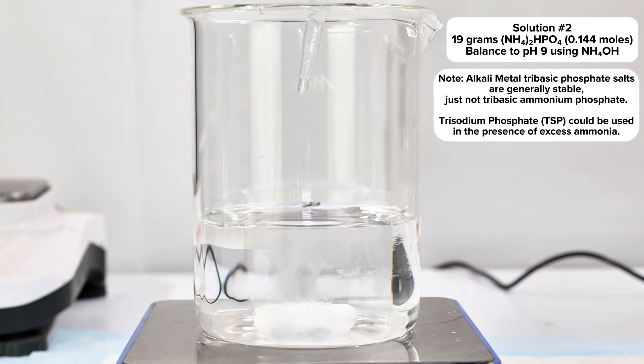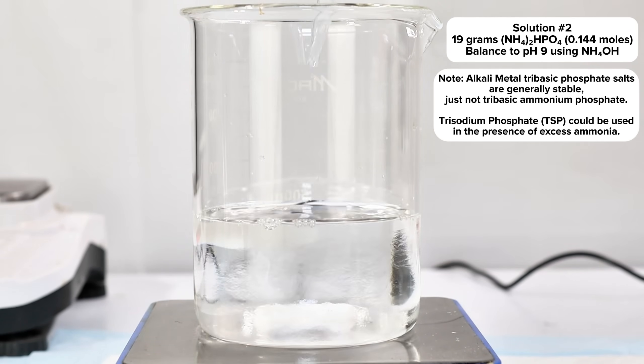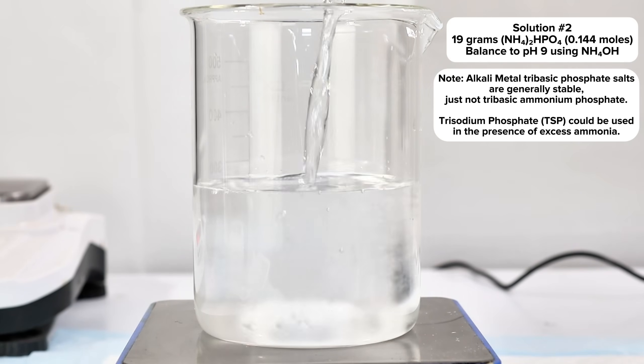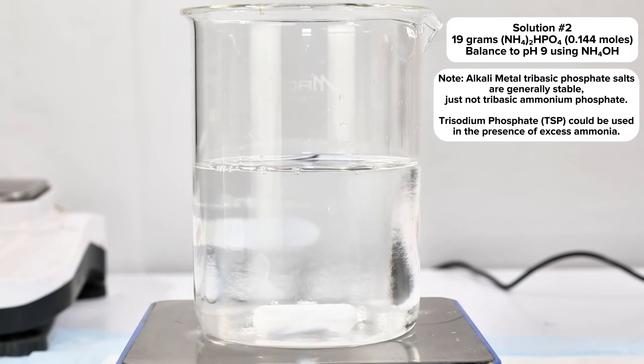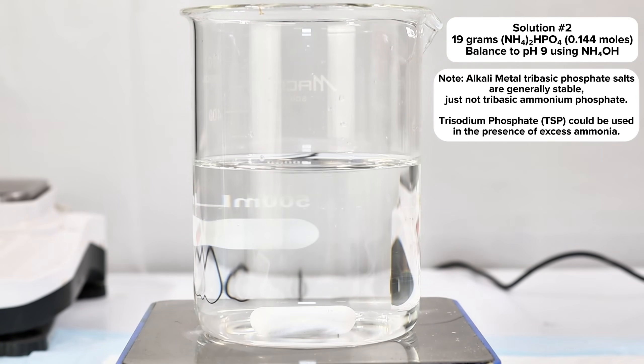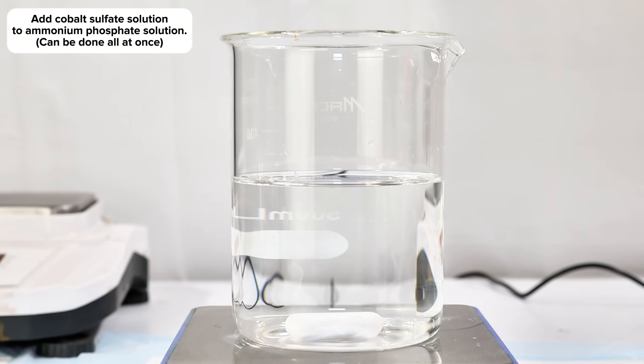Instead, I simply dissolved 19 grams of diammonium phosphate in some water and added concentrated ammonium hydroxide until the pH was around 9. This represents a notable excess of phosphate relative to what's required for the reaction, which I've found helps really maximize the final yield.